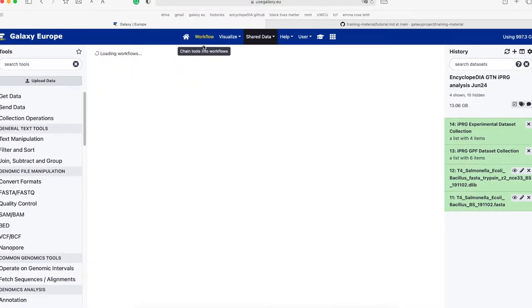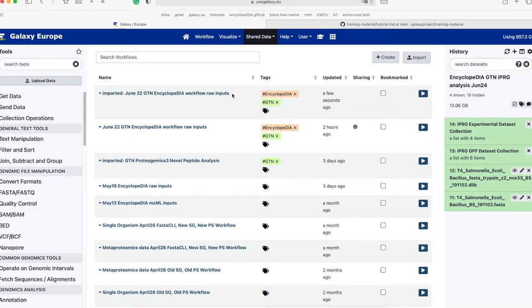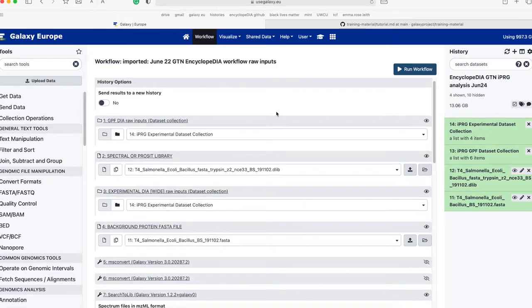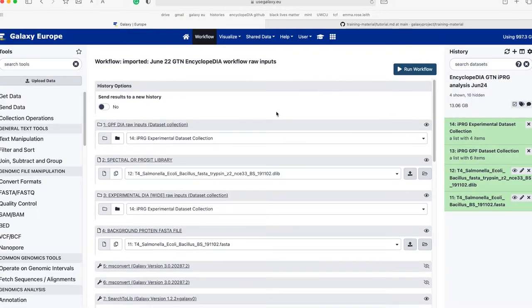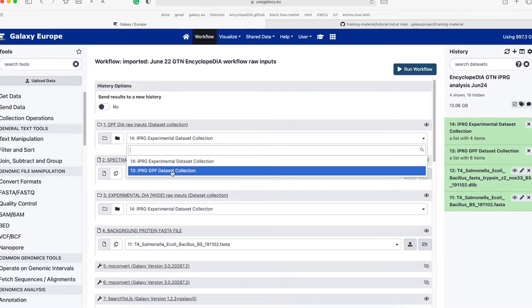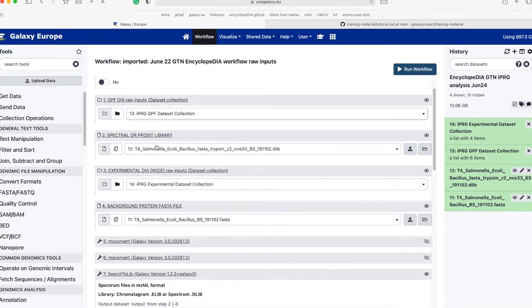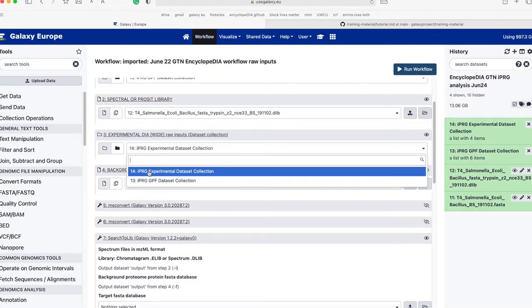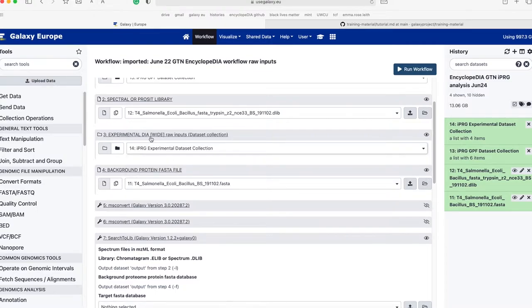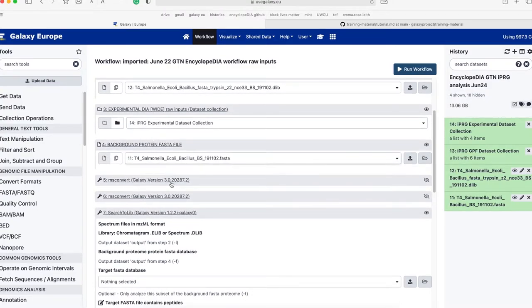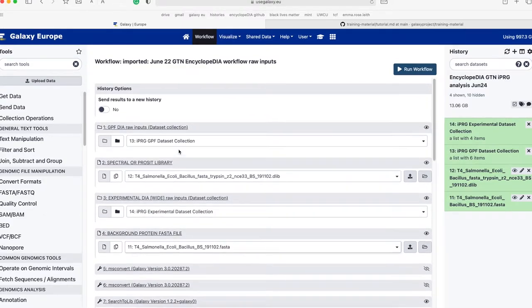Then go to the Workflows tab at the top. Here we see the imported 'June 22nd GTN Encyclopedia Workflow Raw Inputs.' Once the workflow is pulled up and we are ready to run it, click 'Run Workflow' on the icon on the right-hand side. Each of our files and dataset collections has a specific place in the workflow. Specifically, the GPF dataset collection goes in item number one, the DLIB file in item two, the experimental dataset collection in item three, and the background FASTA file in item four. Once all inputs are in their correct slots, click Run Workflow.